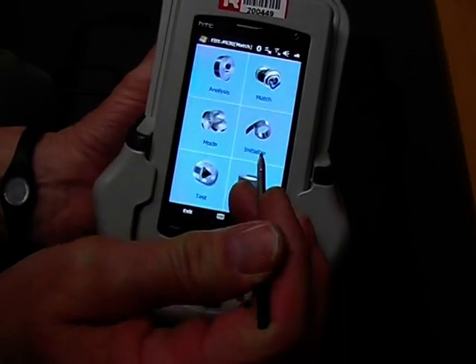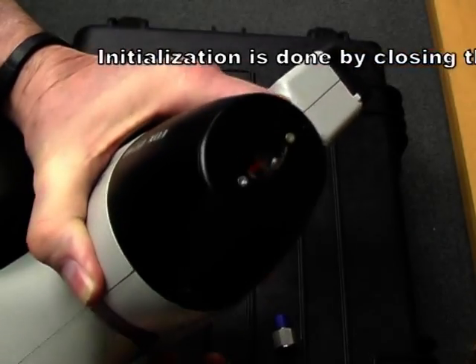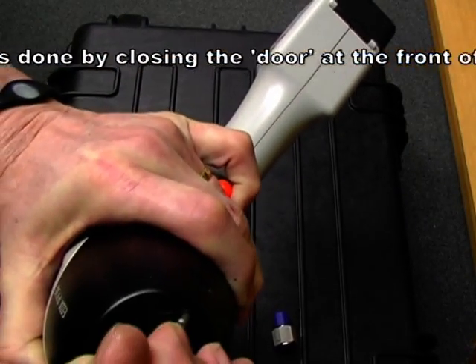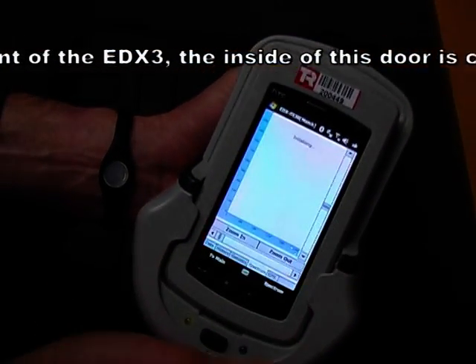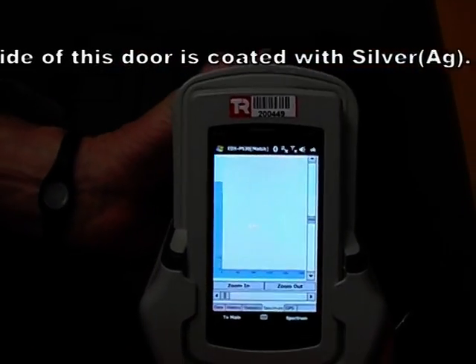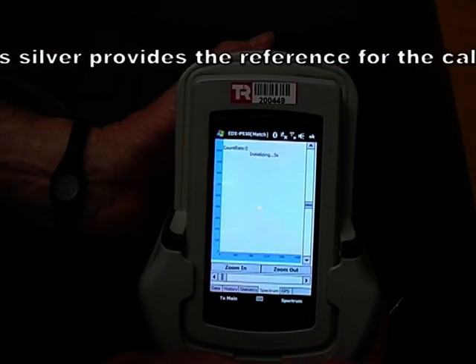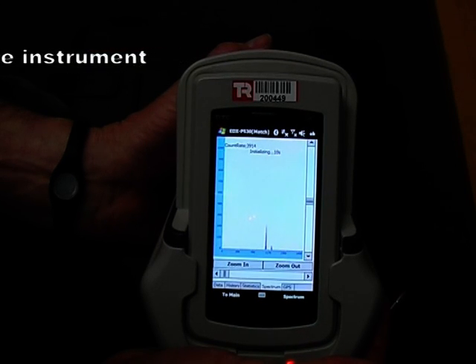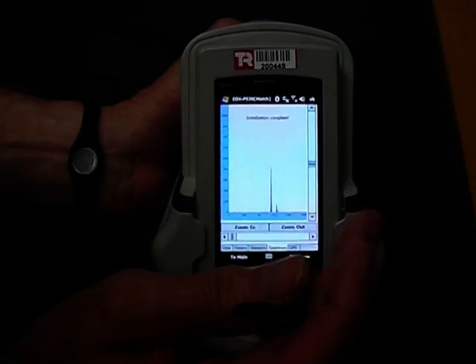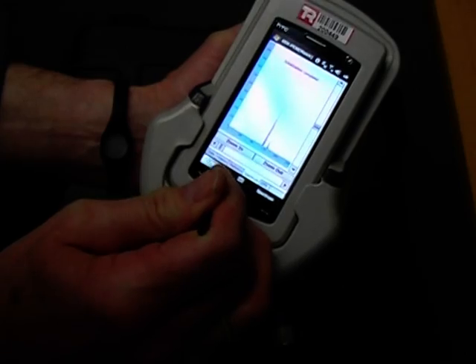Now if we haven't done it for a while, we'll need to initialize. I'll show you how to initialize. When we hit the initialize button, we have to close the window here — the window is closed. The instrument will now initialize; it's testing the silver standard. Initialization is complete and we're going to return to the main menu.